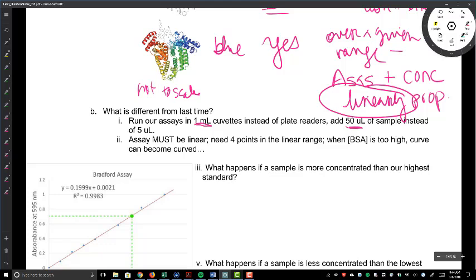So you're going to create your standard curve by looking at BSA standards in a cuvette one by one. You also need to let the reagent react with the protein, and that's between 5 minutes to 1 hour. So before, you let your Bradford and your protein sit there for like 2 hours. In this case, if you want an accurate result, you can't let your sample sit for more than an hour before you read it after you add the Bradford.